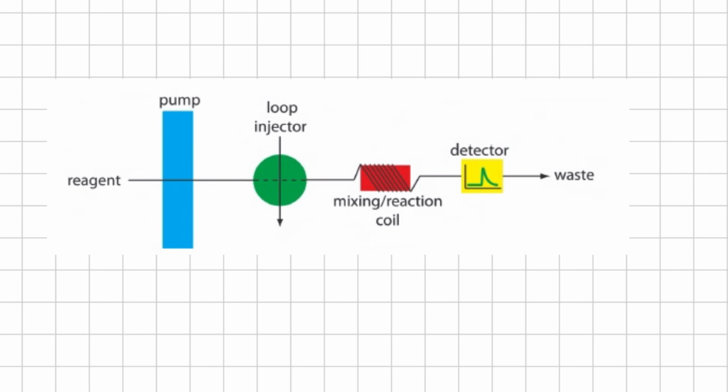some pH electrode for determining the pH of the solution, or an ion selective electrode to determine the concentration of metal ions. We can also use a single channel manifold system in which we monitor the product of a chemical reaction between the sample and a reactant. So in this case, the carrier stream both transports the sample to the detector and reacts with the sample. Because the sample must mix with the carrier stream, a low flow rate is used.